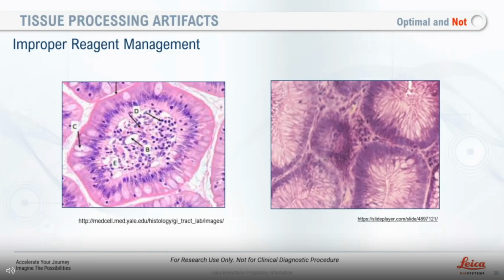Oh, I don't know that you can. The architectural damage has been done. I am not aware of being able to undo it. There are some things that we can do when it comes to processing, but it usually deals with under processing, not over processing. All right. Thank you.